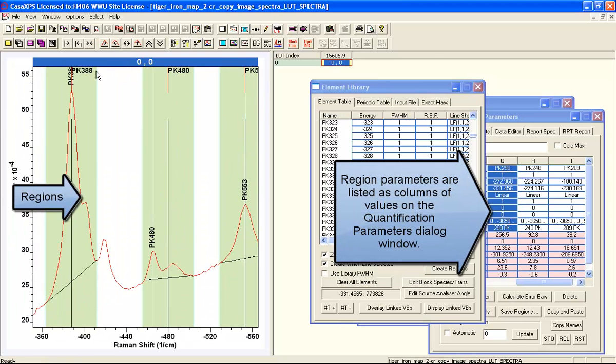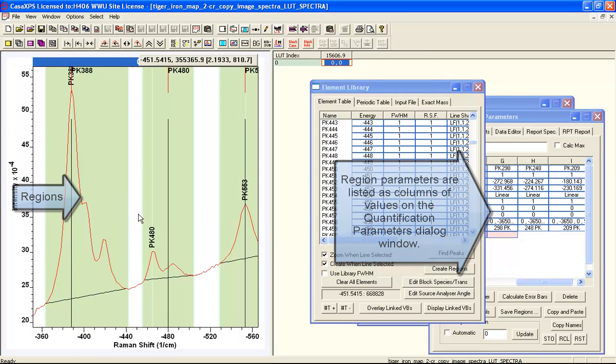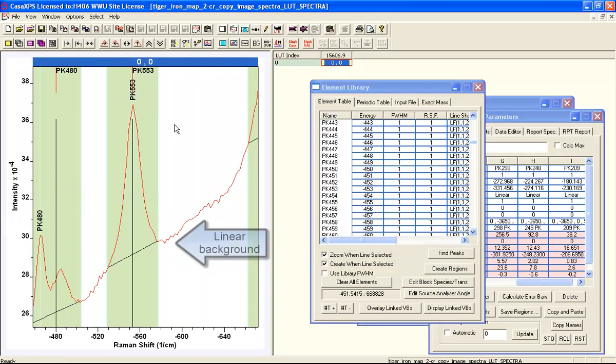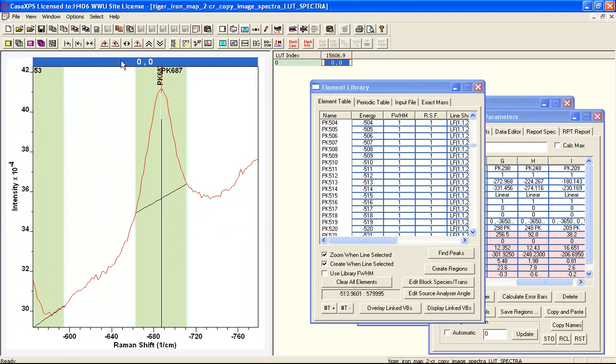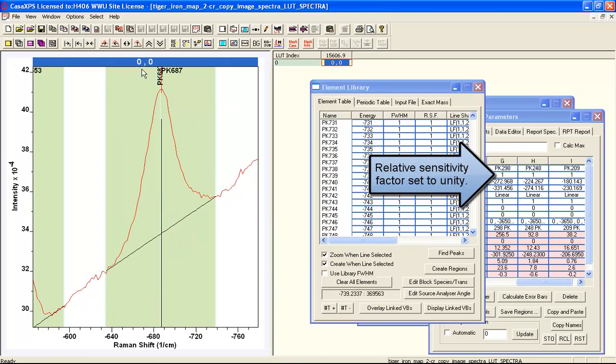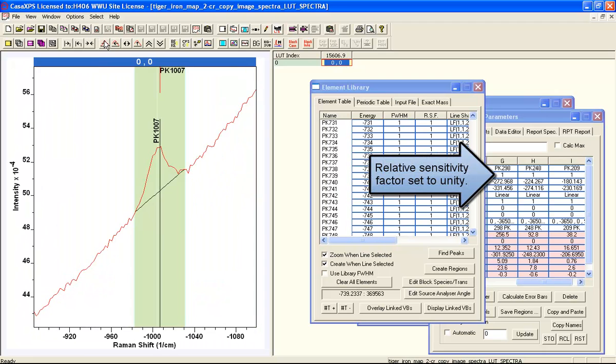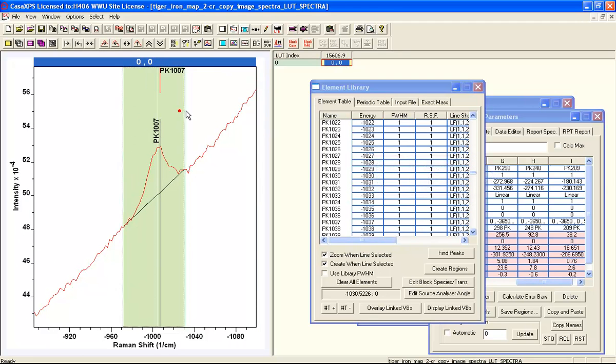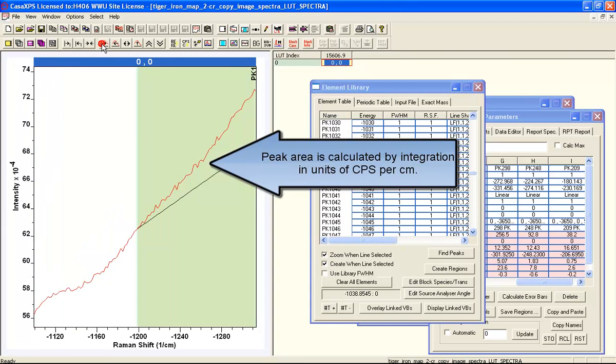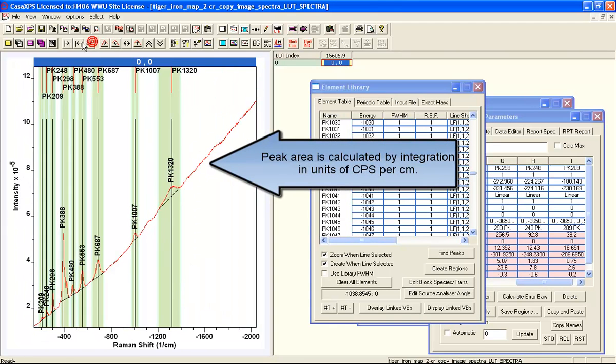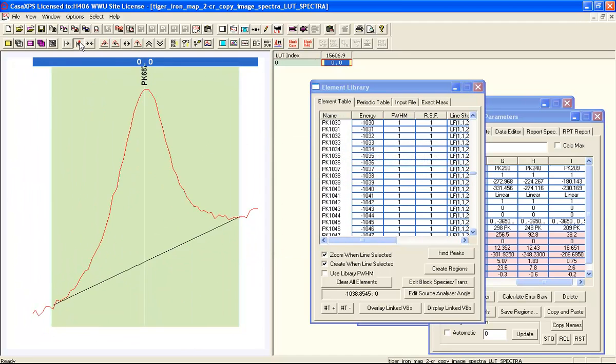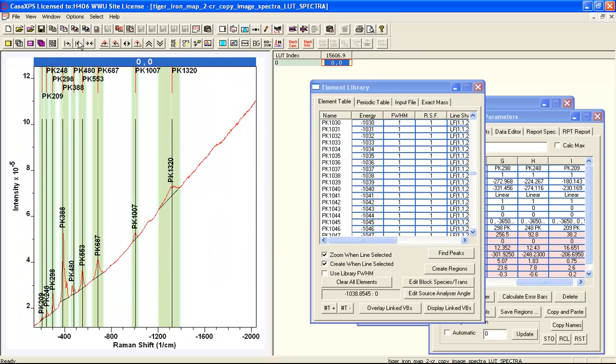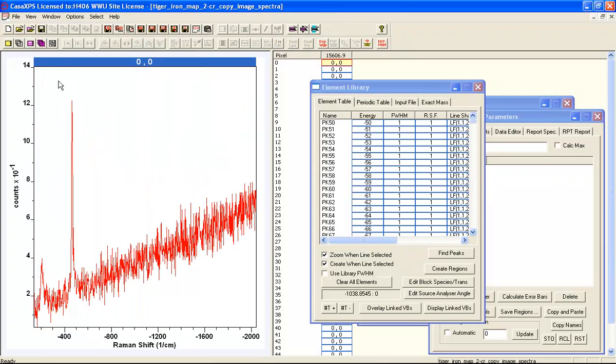Once we have these regions, and we've verified that the backgrounds are in the right place, and we've gone through and organized the regions, given them names, make sure the relative sensitivity factor is 1 in this case. We're not interested in the actual atomic concentration. We're wanting to normalize only the intensities. So we will set up these regions on the survey spectrum, and then we'll return to the spectra at pixels and propagate from this survey spectrum with the regions to each of the spectra at pixels from this map.